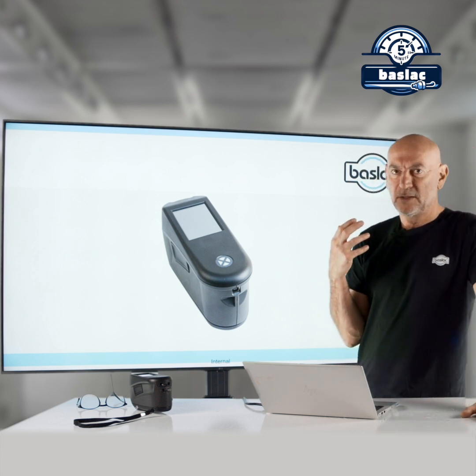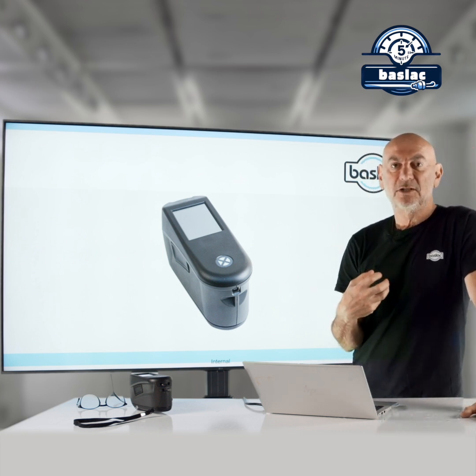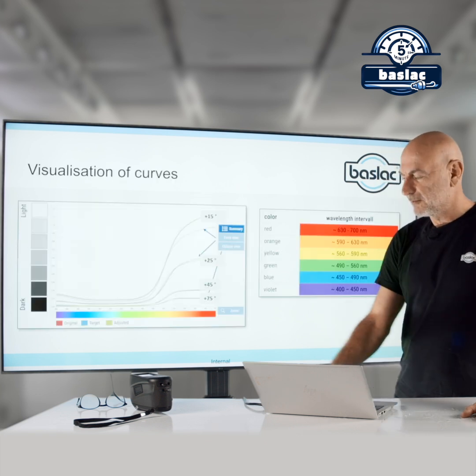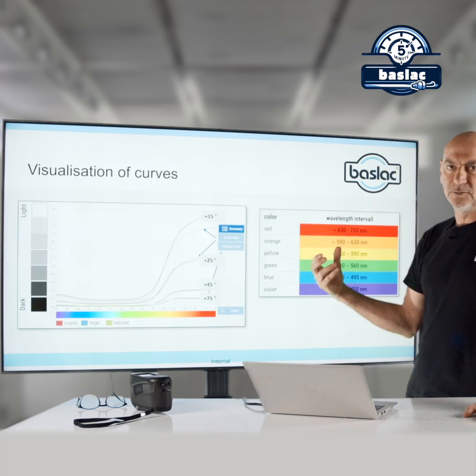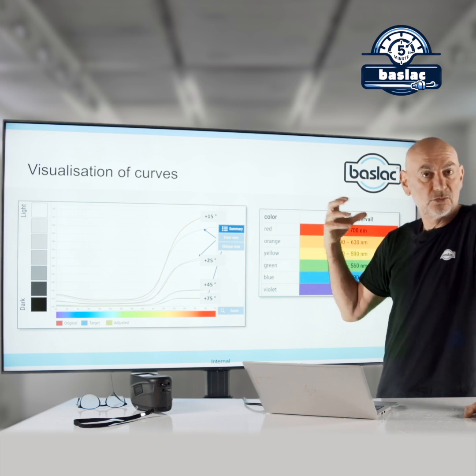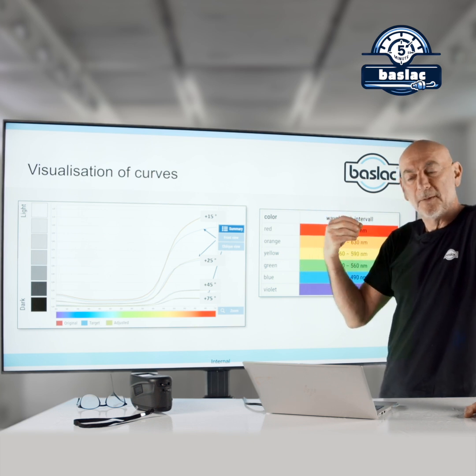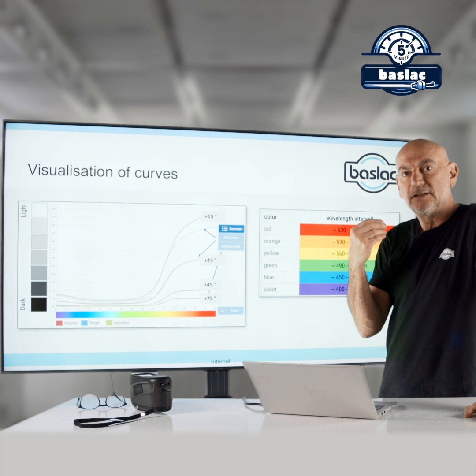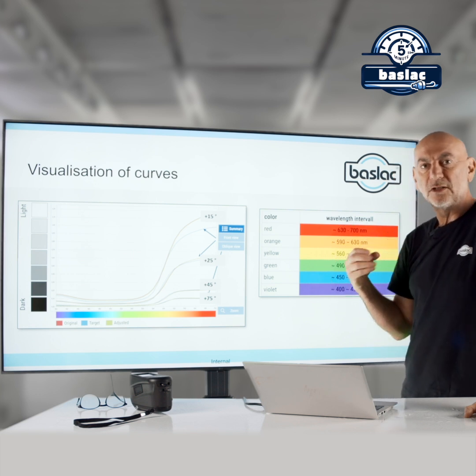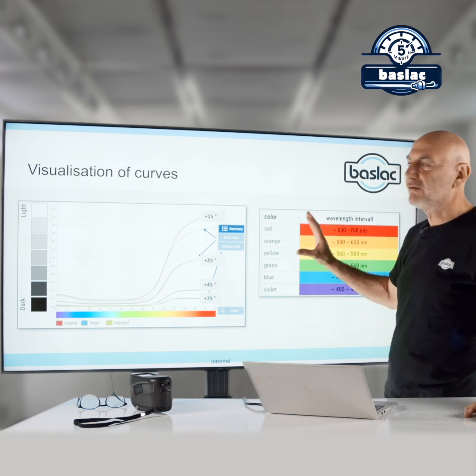So after downloading the formula in our software, you are receiving some curves. I want to go with you through the topics and the importance that we have to look for when analyzing a color curve. But before that, I want to quickly explain what you can find in your software.